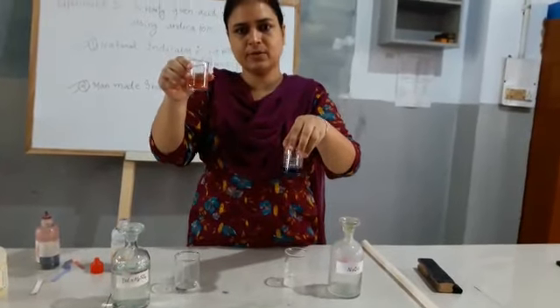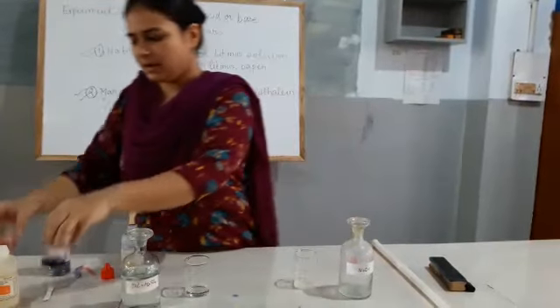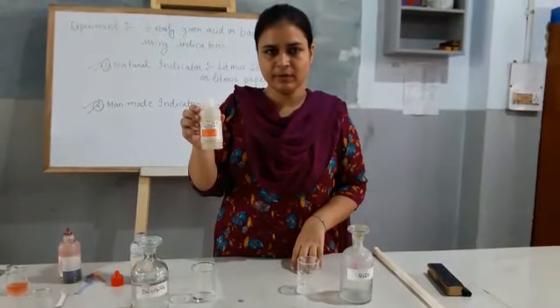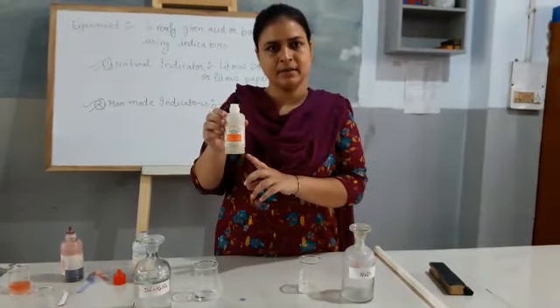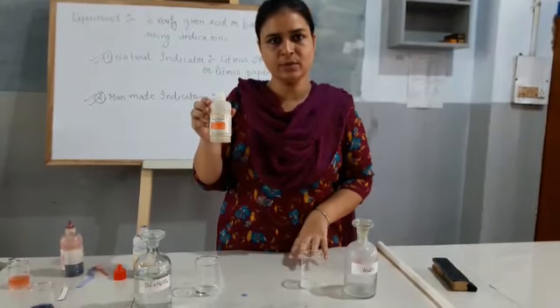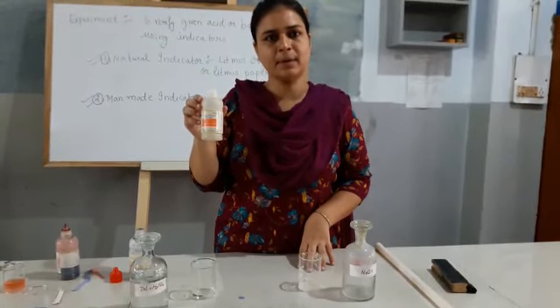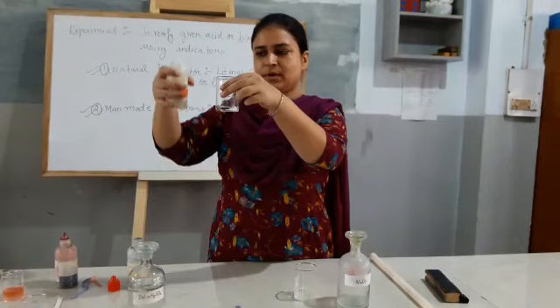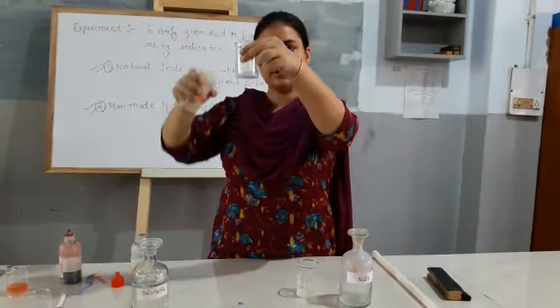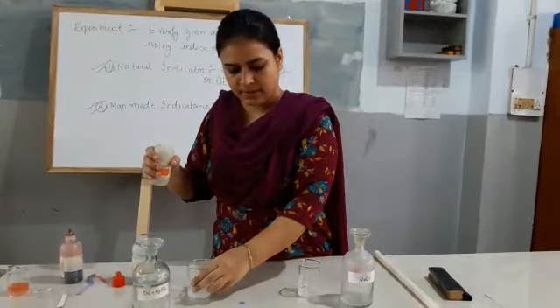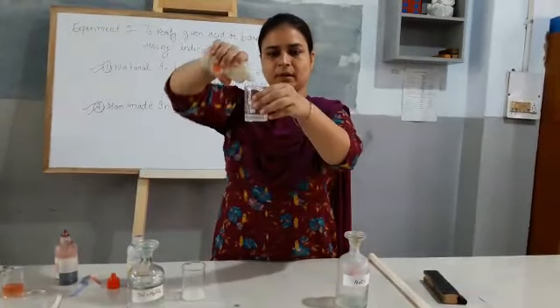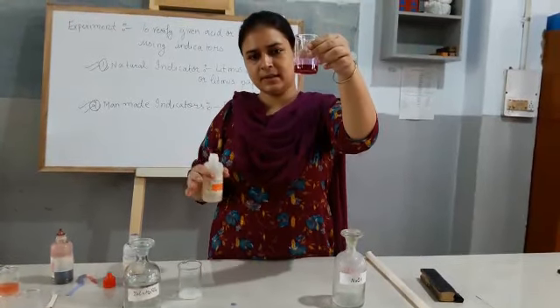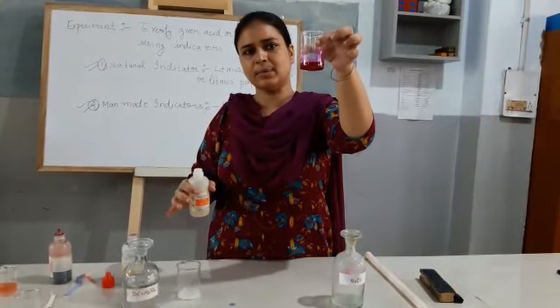This was our natural indicator — that was litmus solution as well as litmus paper. Now, the second part is the man-made indicator, that is phenolphthalein. In acid, phenolphthalein gives no change in color, and in base, it changes to dark pink color. I have taken sulfuric acid in this beaker. I am putting phenolphthalein in it — see, there is no change in color. But when I put it in the base, see the dark pink color. So phenolphthalein in acid remains colorless, and in base it changes to dark pink color.